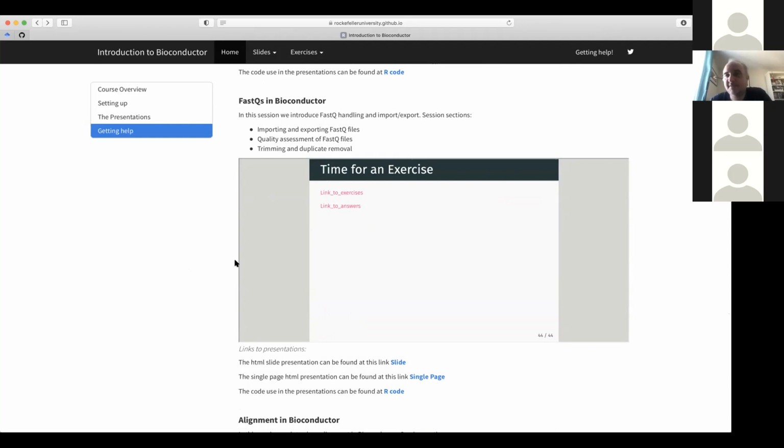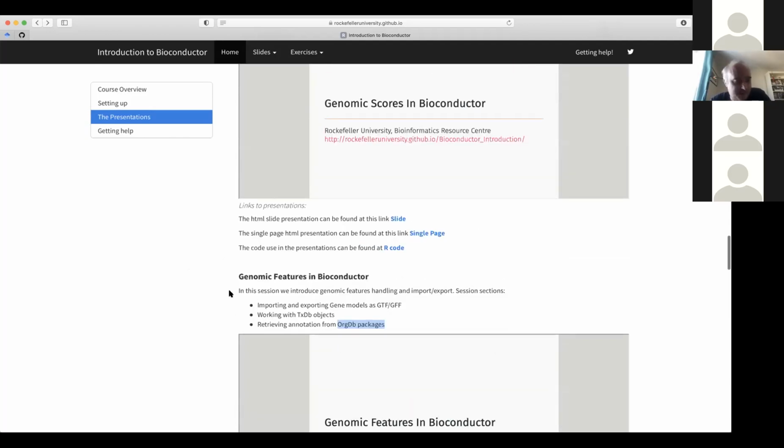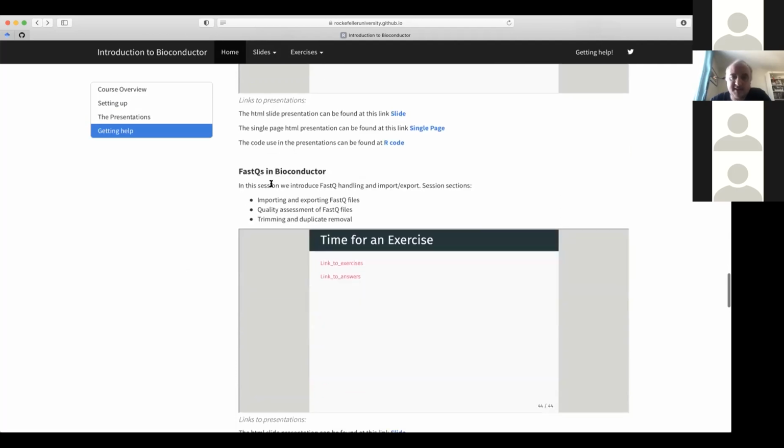And then today we started to work with the actual data we've got, no longer just structures, but actually taking the data, FASTQ, our raw sequence data. How do we get this into R? How do we do a little bit of quality assessment? And if we wanted to, and we saw in the last session we don't need to, we can do some trimming to remove adapters or poor quality tails.